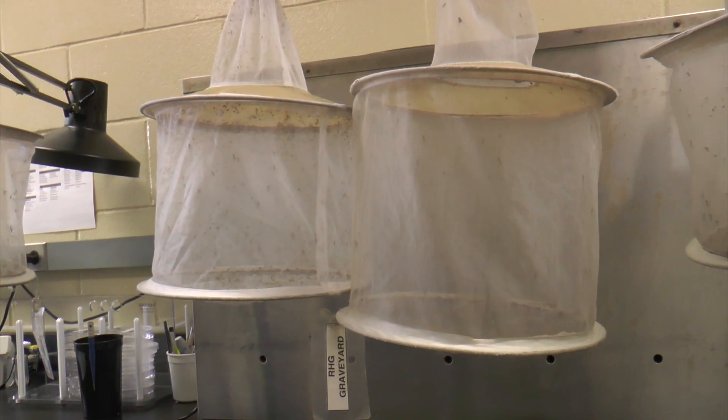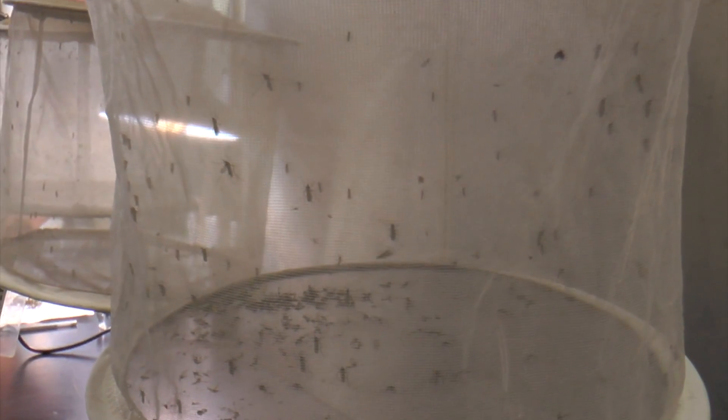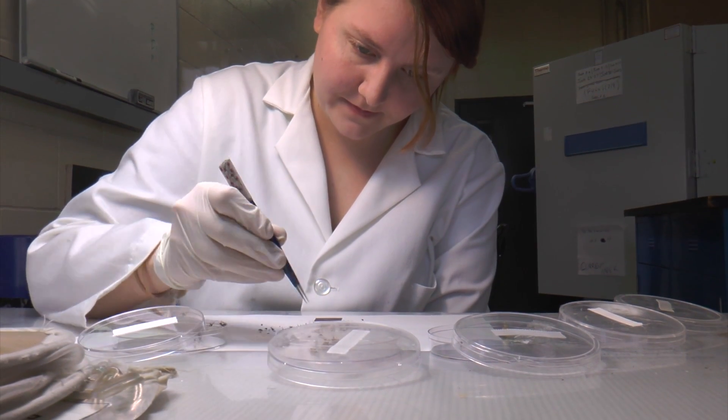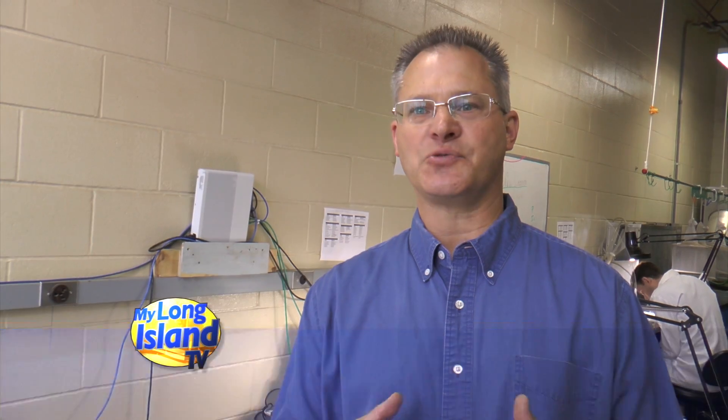These are the traps that went out last night. They came from different areas in Suffolk County. We're processing the traps, picking out the female mosquitoes. We're going to identify them to species, look at what we have in each trap, pick what we want to test, and send it up to the New York State Arbor Virus Lab for testing.